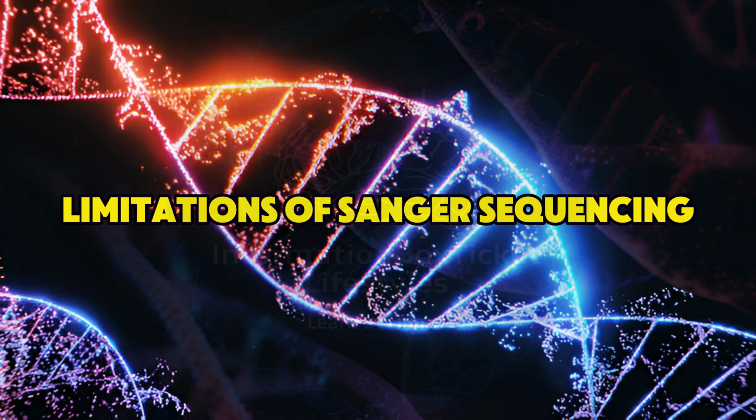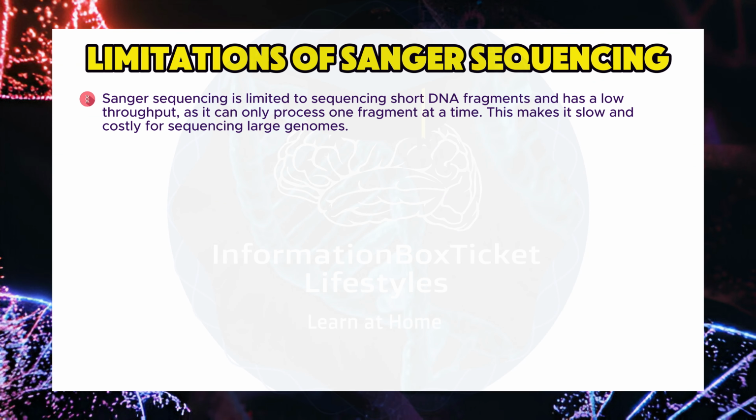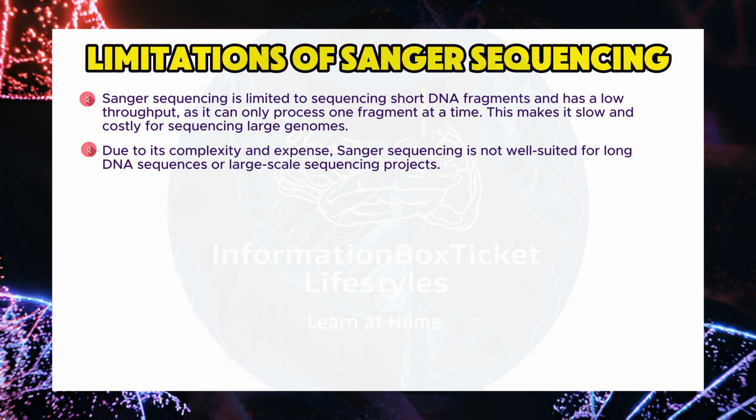Limitations of Sanger sequencing. Sanger sequencing is limited to sequencing short DNA fragments and has a low throughput, as it can only process one fragment at a time. This makes it slow and costly for sequencing large genomes. Due to its complexity and expense, Sanger sequencing is not well suited for long DNA sequences or large-scale sequencing projects.